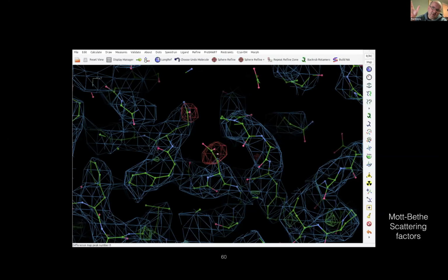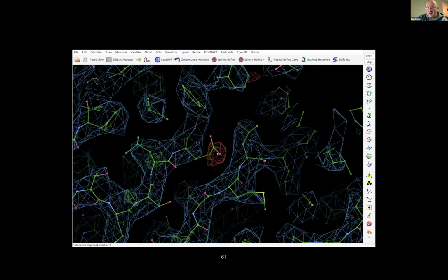And what that means is you can do B-factor modifications sort of on the fly if you can tolerate 20 seconds per update. But certainly when we look at other side chains, we can wonder or worry about radiation damage, as it might be in this case.